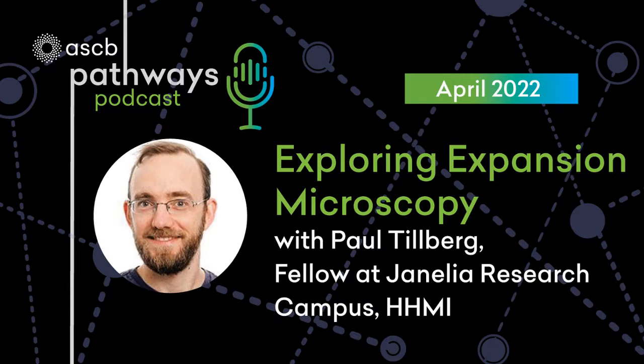And by thinking about that idea over a span of months and then bringing in that intuition about polymers and how they behave, I eventually had this idea that if you could just anchor the fluorescent things that you want to look at directly to a material that you engineer and synthesize everywhere in the specimen, and then dissolve the specimen so that it doesn't have mechanical structure, then you could expand that engineered material and it would be like a 3D fluorescent expandable cast.